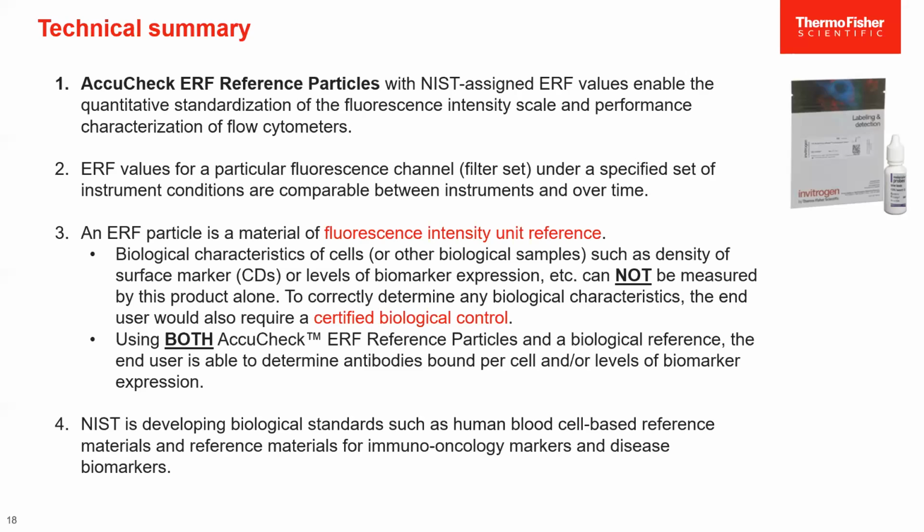You need to have biological controls. So you use both the biological control and the Accu check ERF beads, then you can assign or examine the level of biomarker expression in your cell sample.